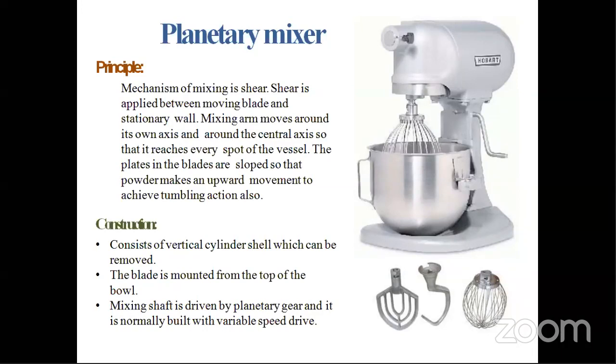It has an RPM changing regulator. By this, you can change the RPM. In this process, the first handle is there at the lower end. You have to check this in the picture. By this handle, you get up and down movements. You create up and down movements of the blade or the mixing. You are adjusting the blade, adjusting the mixing with the vessel by this handle.